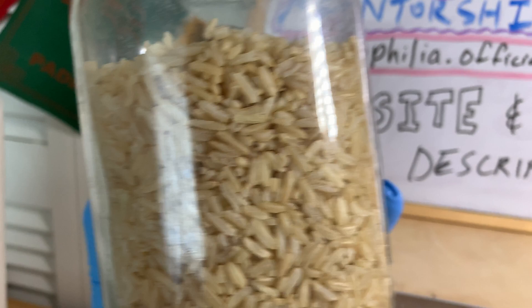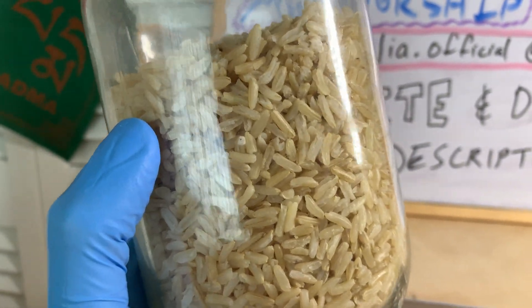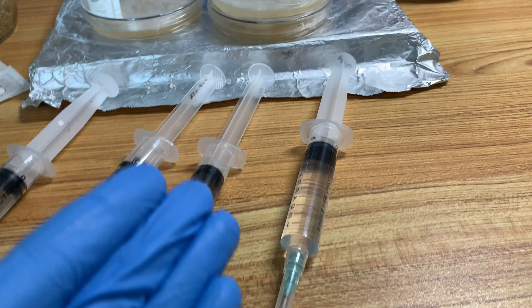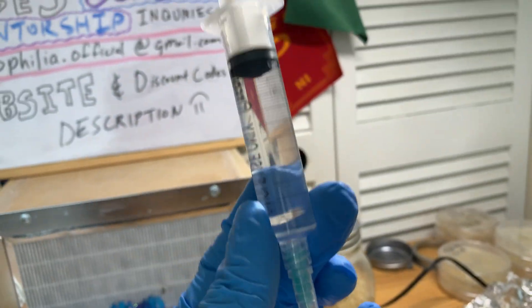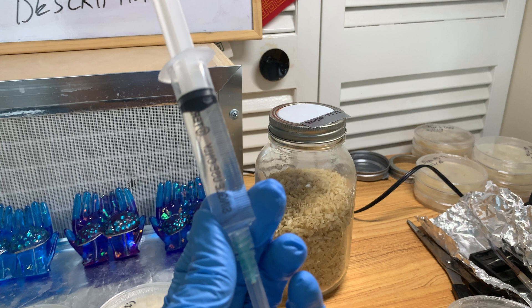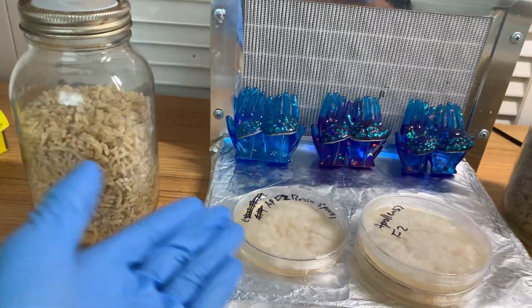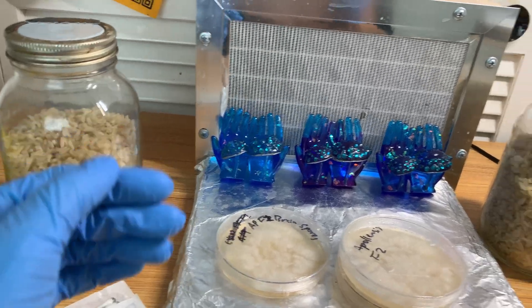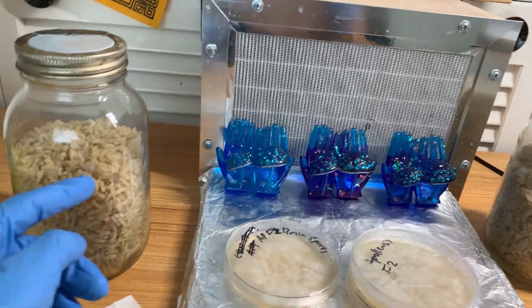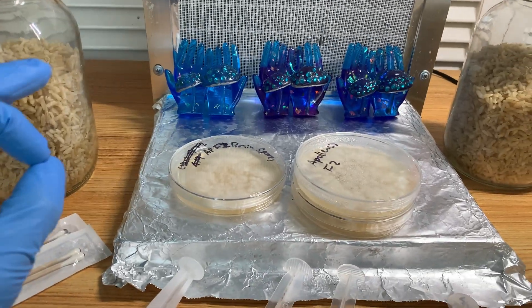Five days is sort of the typical timeframe — five to seven days until you start to see growth. But if your syringes are freshly made and properly made, it doesn't matter how thick they are, because the spores themselves are virile. Having said that, the opposite is also true: you don't want too few spores, since you'd be giving potential contaminants a better chance against the mycelium. These spores are older — I can tell from performance and from the print date, which is almost a year old.